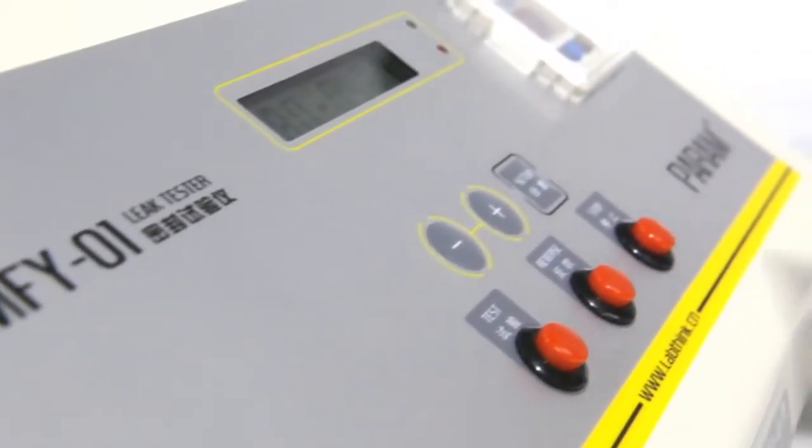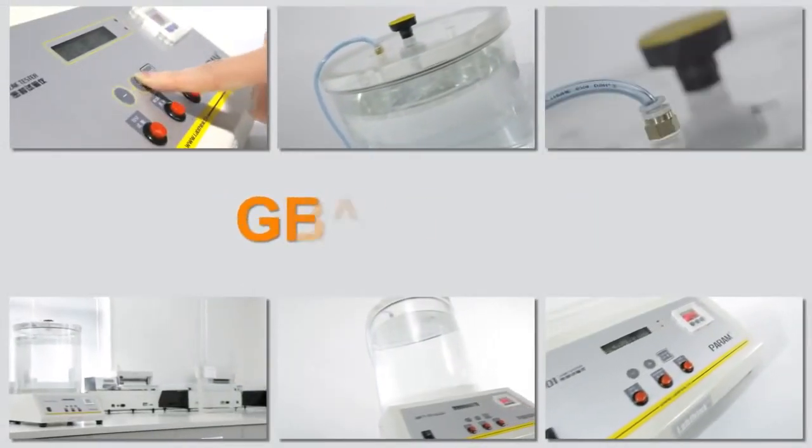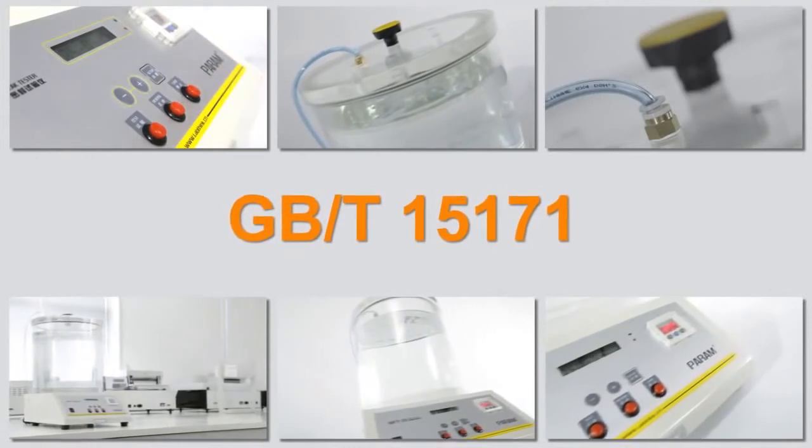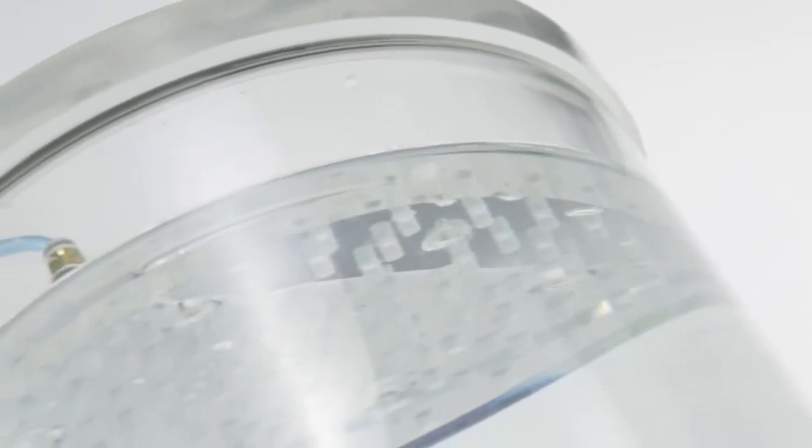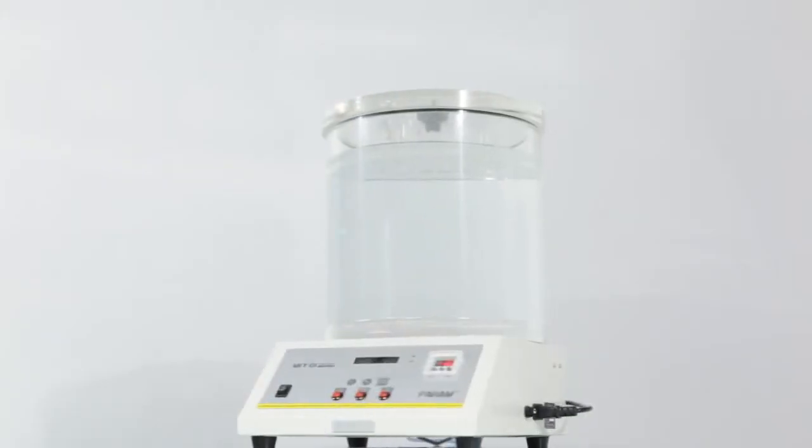The testing principle complies with ASTM D3078 and GBT15171 standards. MFY01, your excellent choice for automatic leak testers.